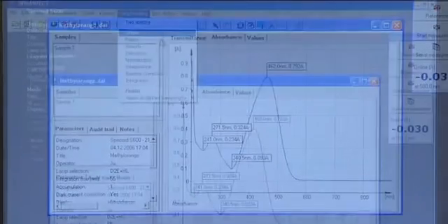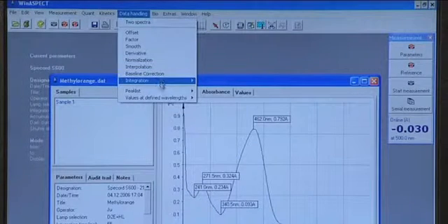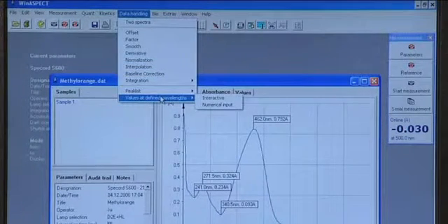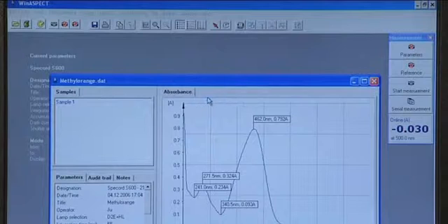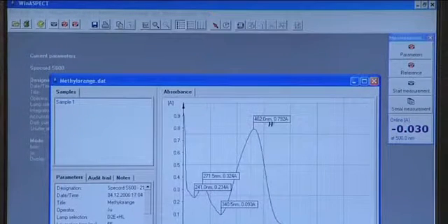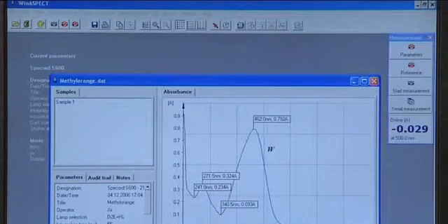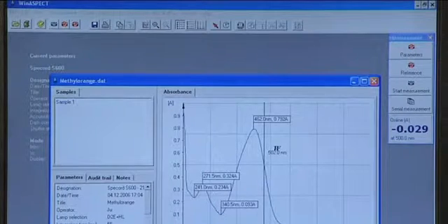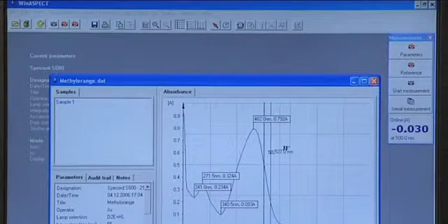The data handling module allows evaluation of the measured spectra by mathematical functions. For fixed wavelengths, by automatic peak finding or interactive wavelength selection. For more extensive spectral ranges, by smoothing, derivatives, integration, or standardization.